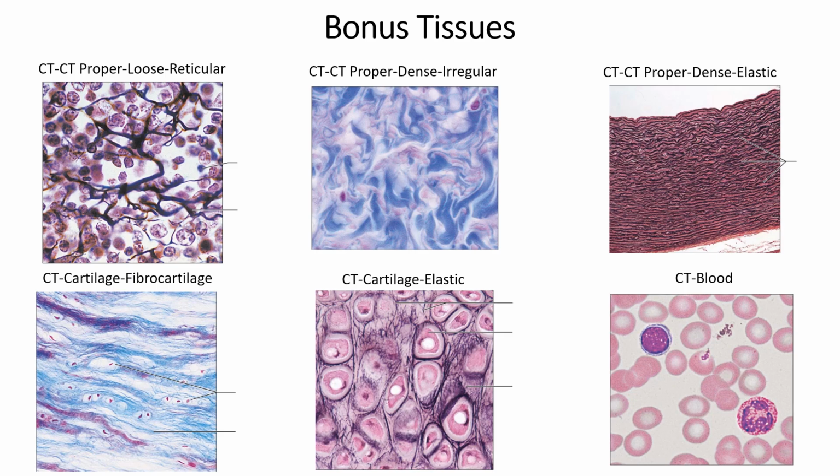Connective tissue, cartilage, elastic. We don't see a lot of ground substance. We can see some fibers. So all of these kind of like strings, spiderweb looking structures are your fibers. And then we have these large circular purple stained structures with the white spots inside. Those are your lacunae.